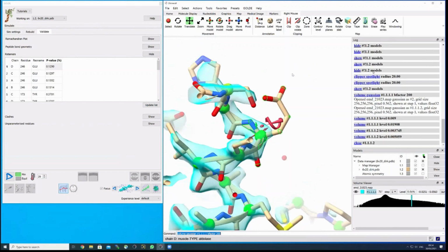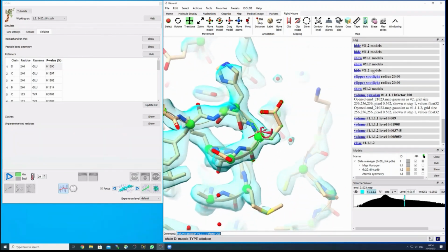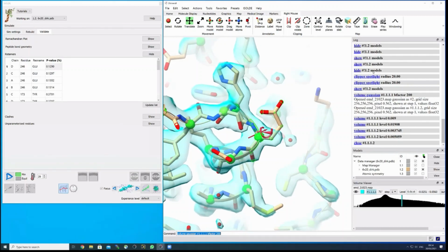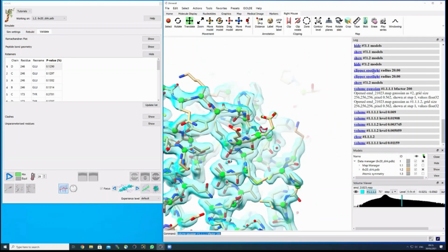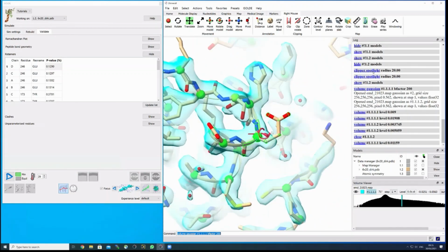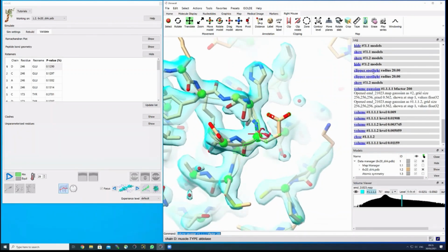On top of this, what you can see here is that this position is at the very outside of the structure. If I blow up the map, there is some sidechain density coming up here, but I don't see the entire sidechain. This has, especially in cryo-EM maps, 2 reasons. Reason number 1 is, and this would be the same for X-ray maps, whatever is located at the outside and has a long sidechain can move a lot.